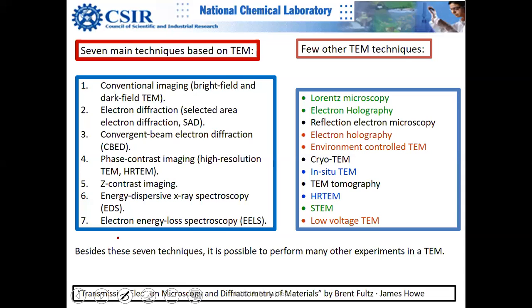Up, down. Or in certain cases, these atoms will move together like a Mexican wave, no matter whether they are cations or anions. Then we can call them acoustic waves. So those are the phonons. The electron also induces phononic vibrations in the lattice.